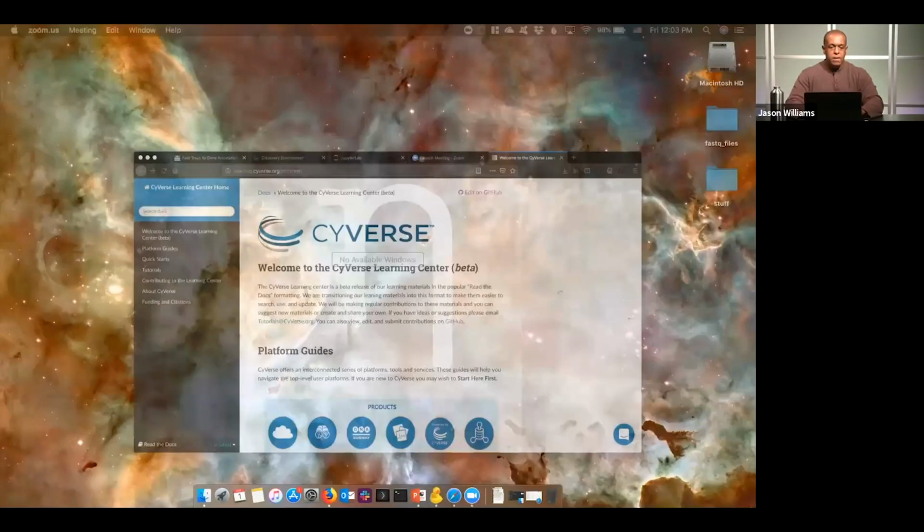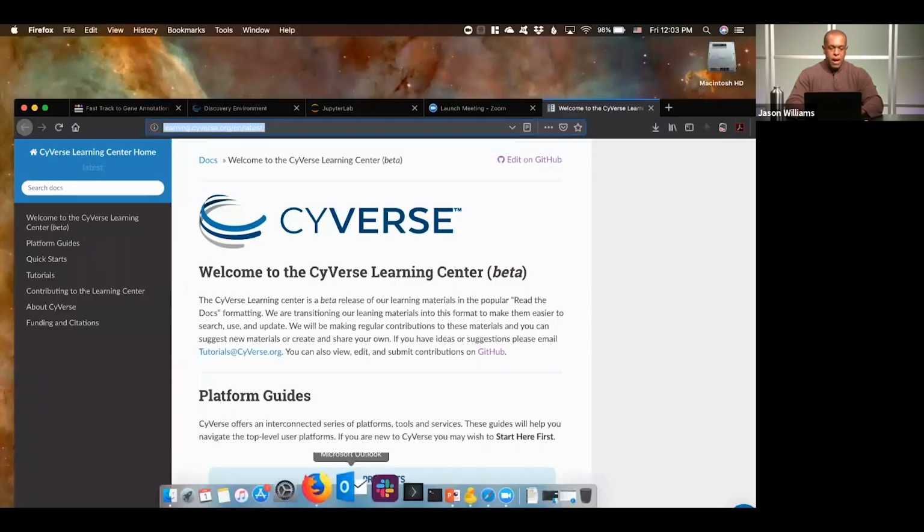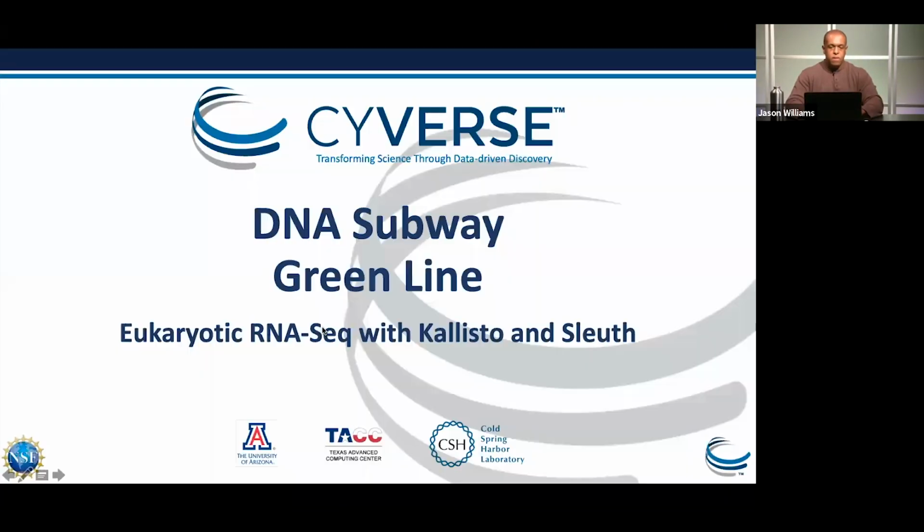Okay, so let me start by showing you just a couple of slides, give you a little bit of an orientation, and as we do, I'll go back and forth between the slides that give you a general overview and show you some specific features of the new and updated Greenline with DNA Subway. So let me go ahead and share my screen. And I'd like to take a look at the Subway slides.